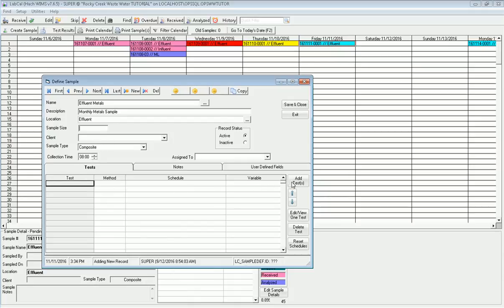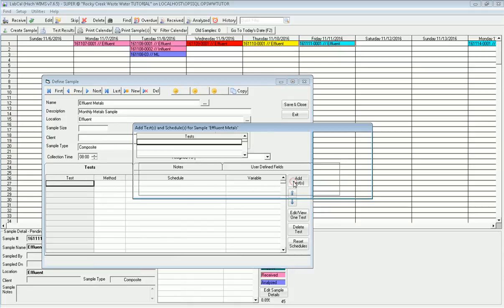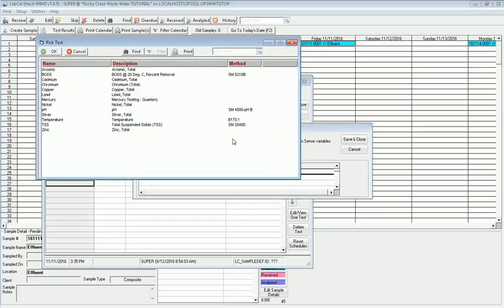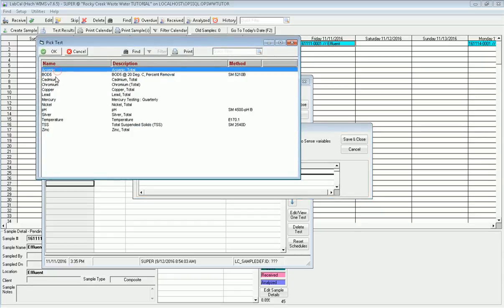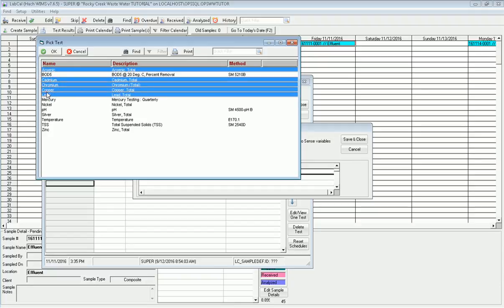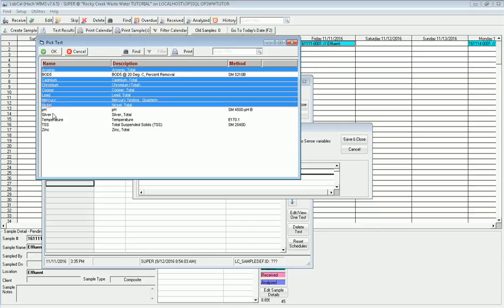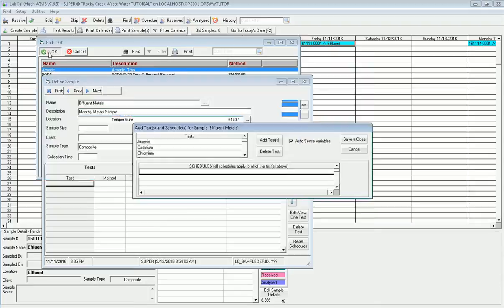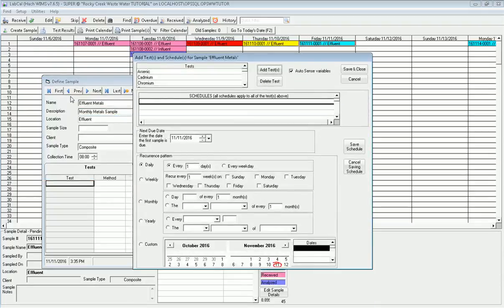Now I'm going to add tests in. What this does is, I'm going to check this auto sense variables, which we'll cover in a minute. I go to add tests, and in this particular sample, I need to do arsenic. I control click on each one that I need to do. Those are the tests I need to run.